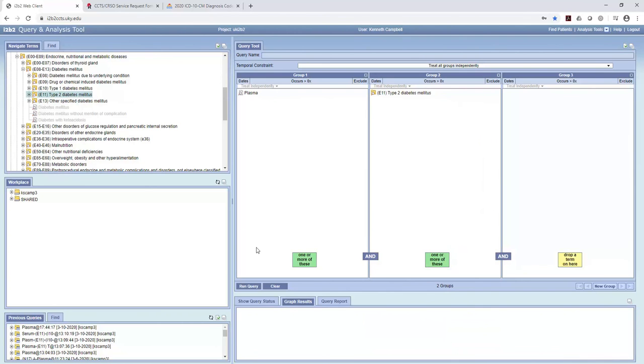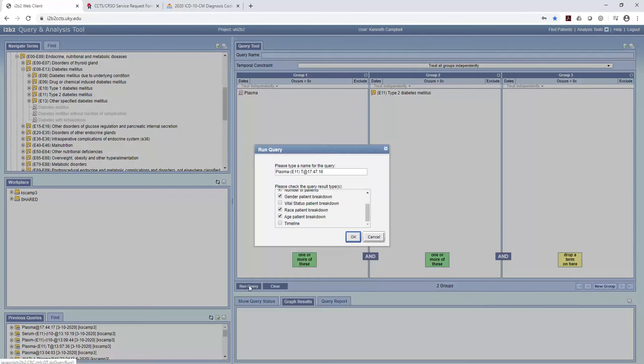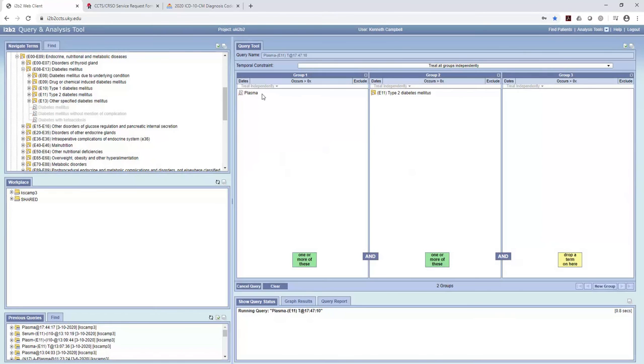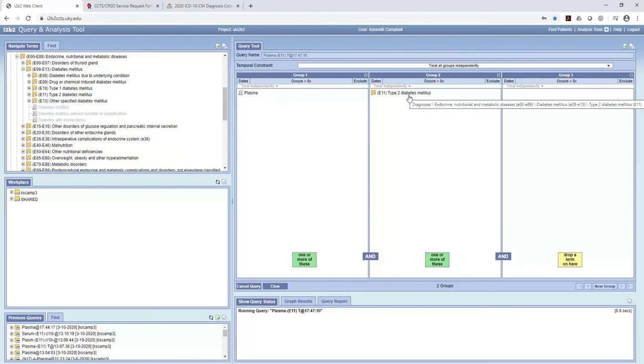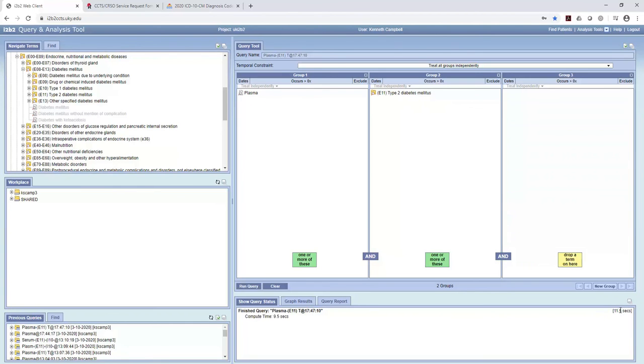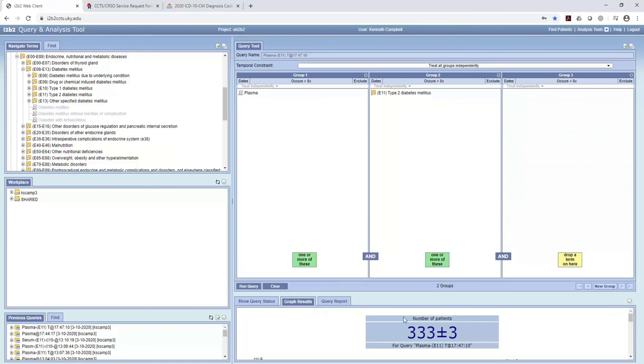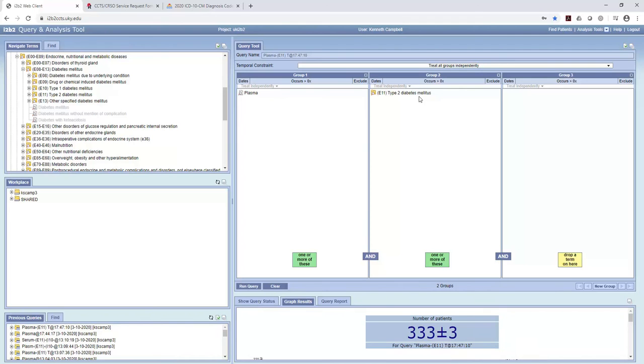So now this search, I'll go run query. This search is going to search for people who we have plasma from who also have type 2 diabetes mellitus. And here's the search running. You can see my little counter going away there. So 333 patients. The biospecimen core has plasma and type 2 diabetes mellitus.